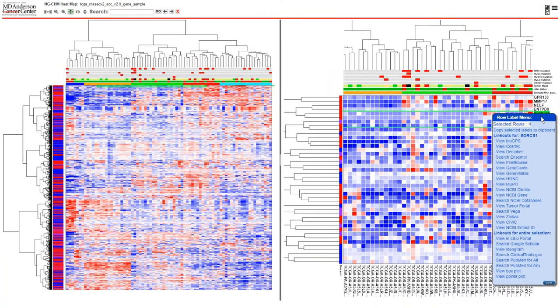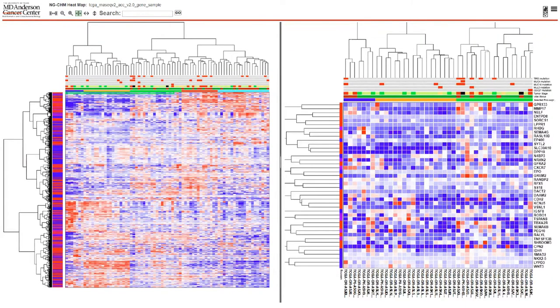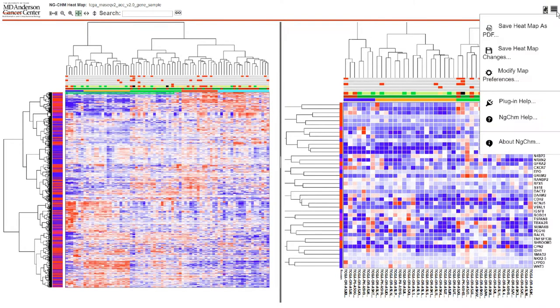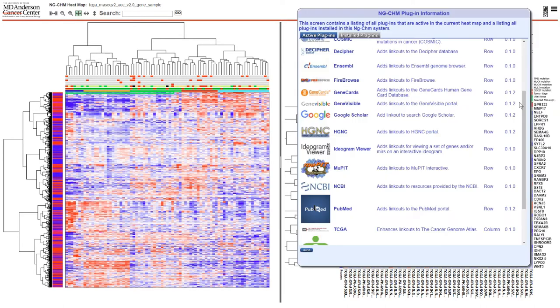The available menu entries also depend on the link out plugins included in the NGCHM viewer. You can display the plugins included in your viewer by selecting the hamburger menu at the top and then selecting 'Plugin Help.' At the top of that menu, select 'Installed Plugins.'